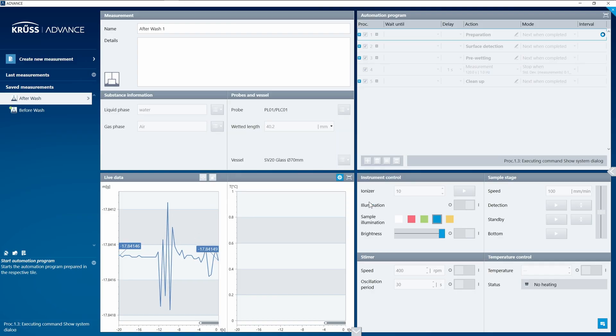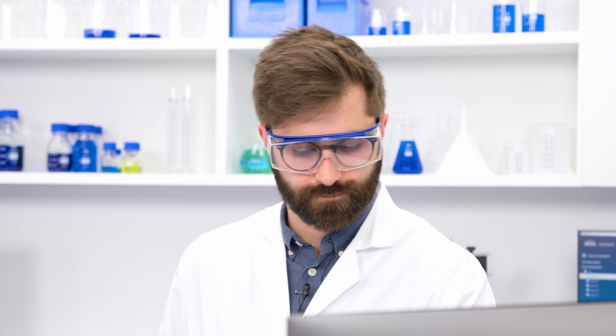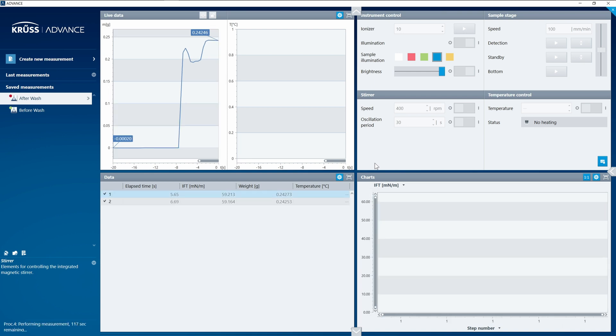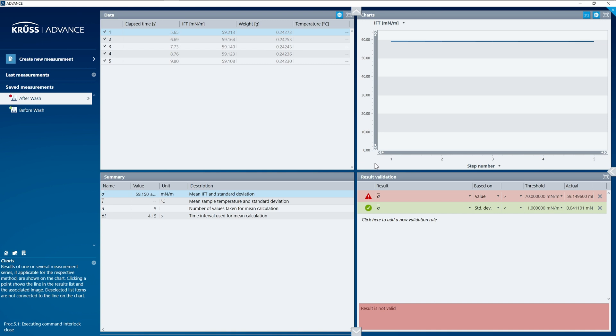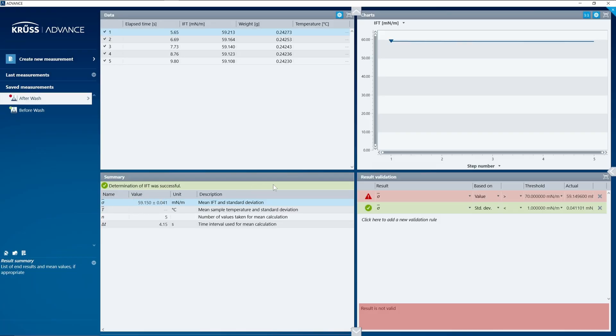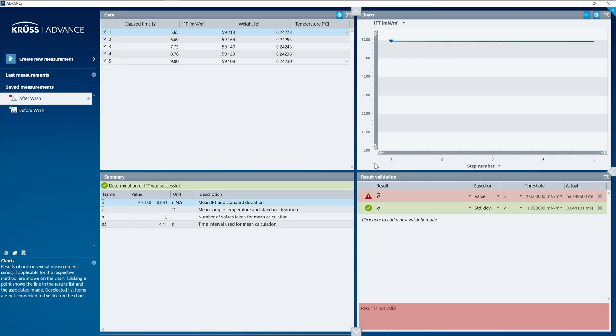I press OK and the measurement starts running. ADVANCE runs through all the steps of the template just as before — unlock the force sensor, zero, stabilize to ensure no environmental vibrations — and when we hear the beep it starts measuring. My first data comes in, and going down to the summary we can see the surface tension of this water has significantly reduced: before it was around 71 mN/m, now it has dropped to 59 mN/m. That tells me I've picked up contamination from the surface, so I know my PMMA plate is not clean — and this shows up in the validation step, which is now red because the surface tension is not higher than 70.